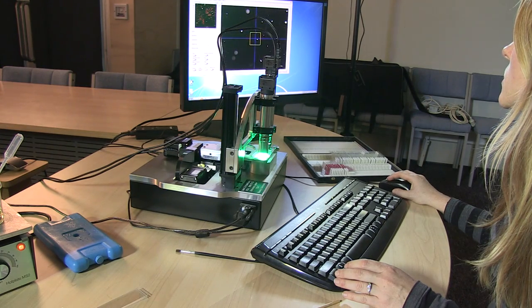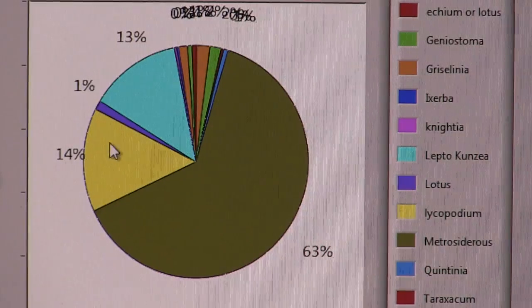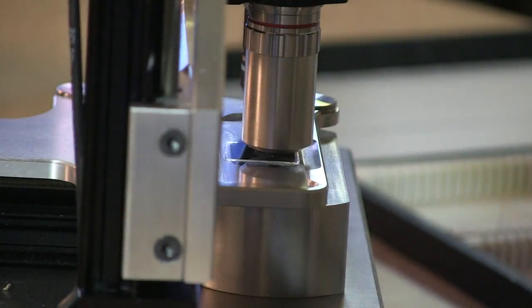The ClassiFinder combines robotics, image processing and neural network classifying technology to locate, image and classify pollen on conventionally prepared microscope slides.